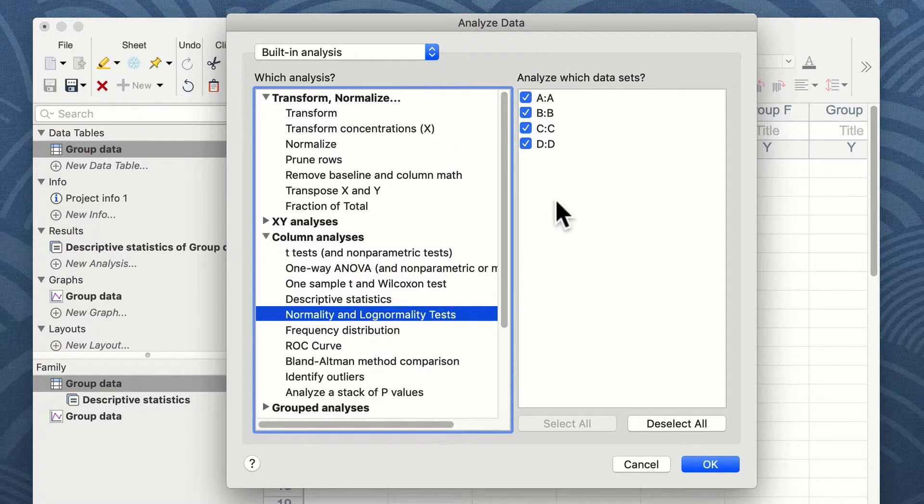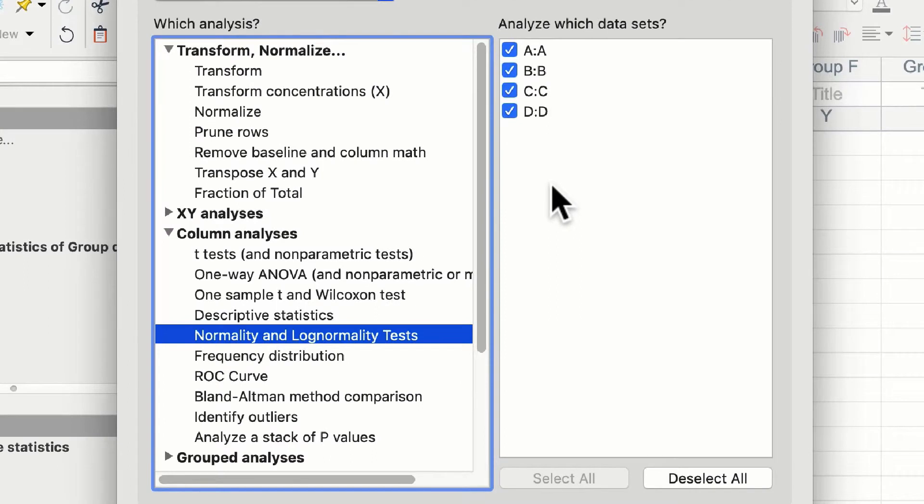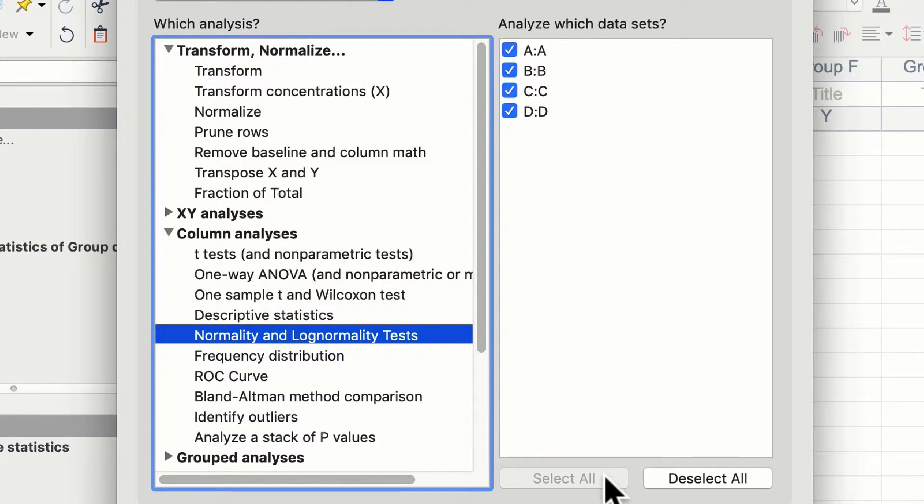On the right-hand side, we can choose which data sets we wish to analyze, and on this occasion once more we want to select all of our data sets. A useful function is the deselect all and select all buttons.